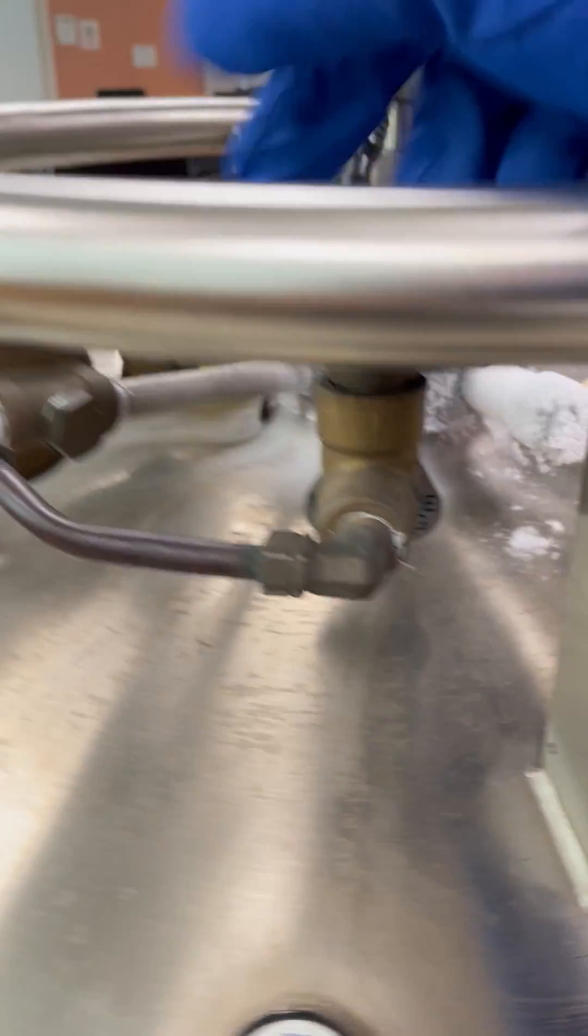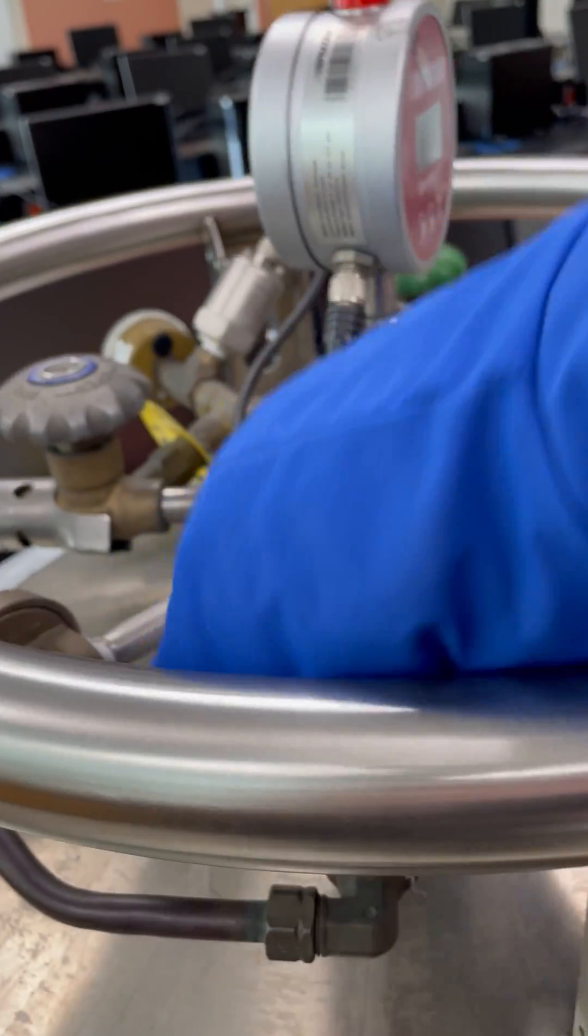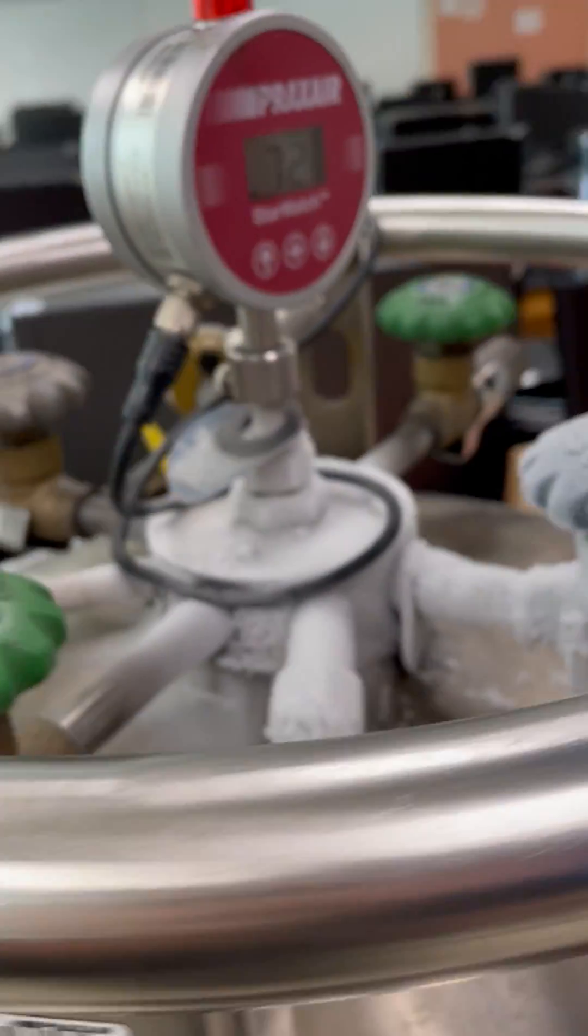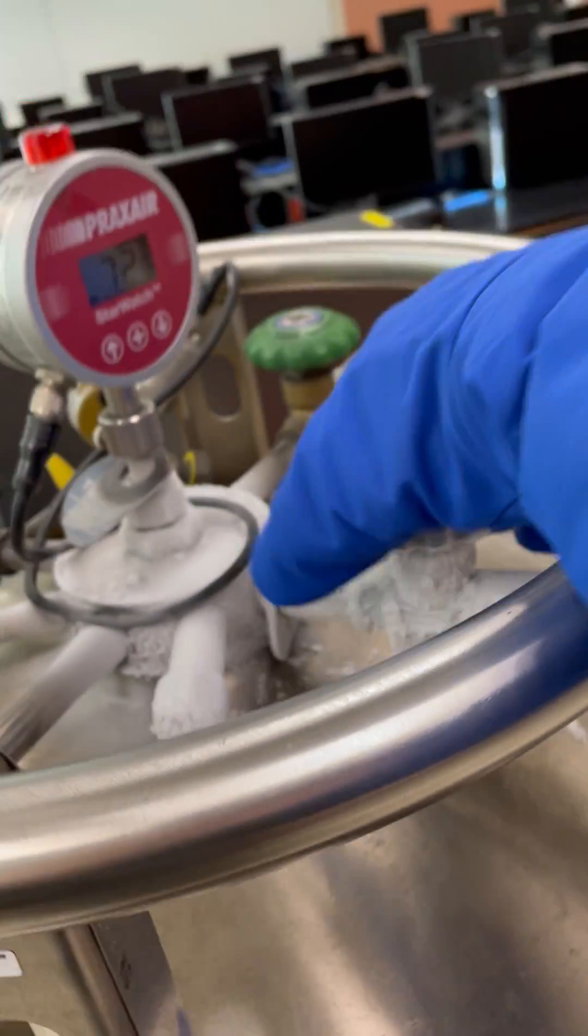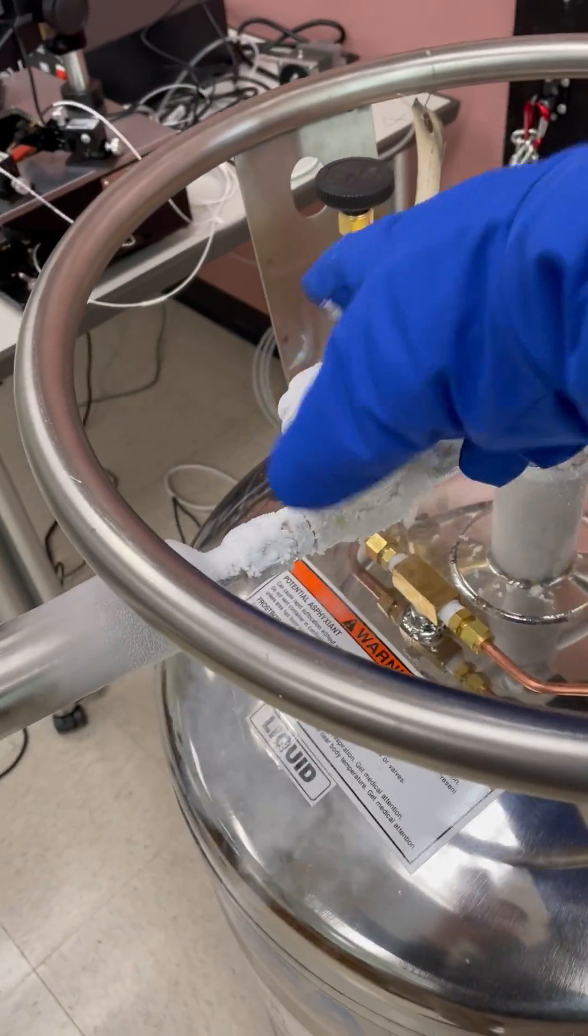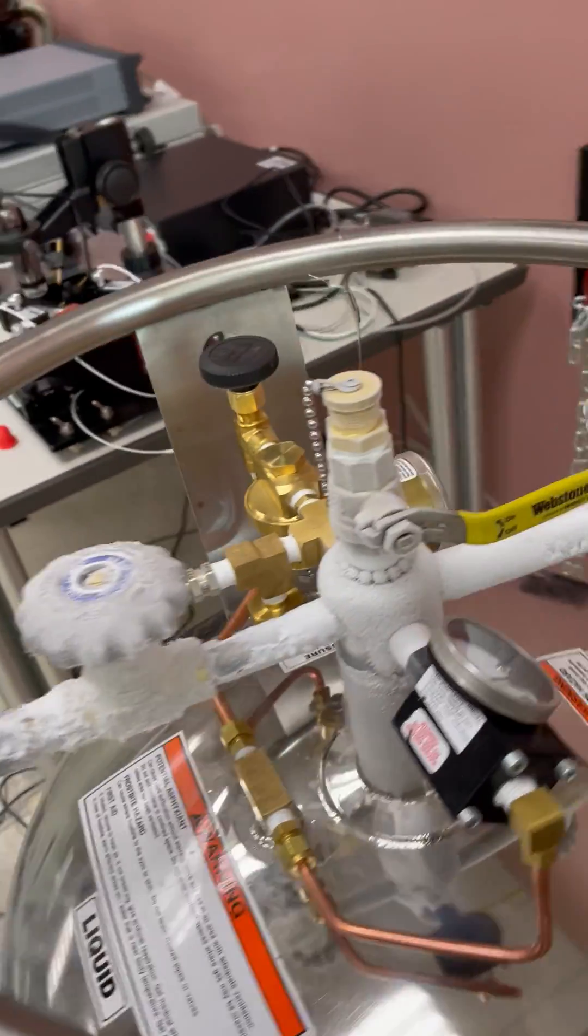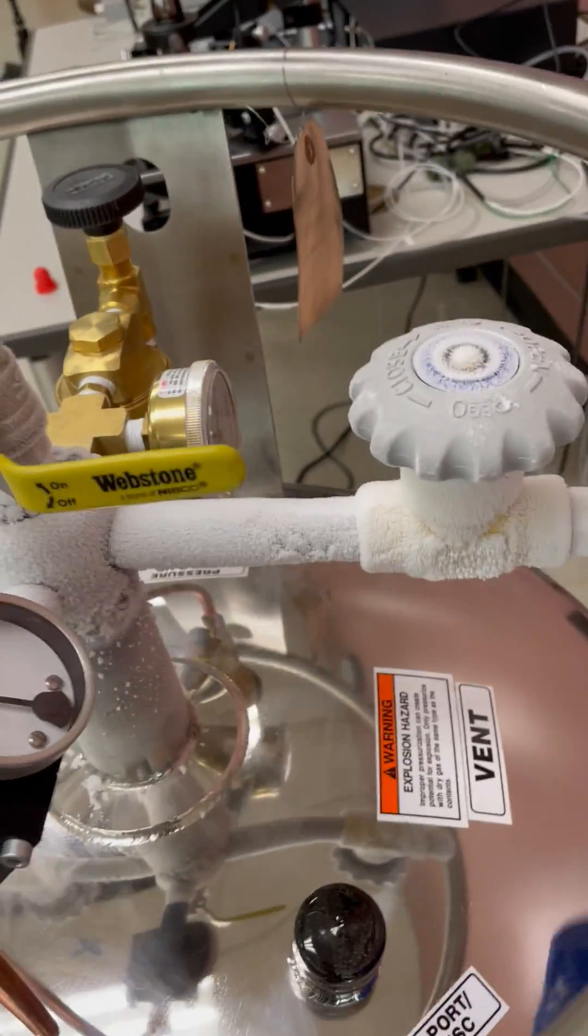Before you do the transfer, make sure that you have fully opened this pressure building valve, right? Fully open means anti-clockwise. And then you fully open this source, also anti-clockwise. And also the destination liquid valve, fully open it.